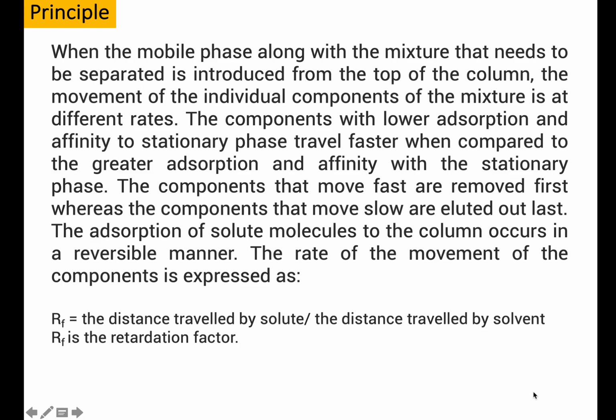How do we do that? We use silica gel or we use alumina. What are they? They are stationary phases. These stationary phases are solid. Different stationary phases can be used for different purposes in column chromatography. For today's lecture, we are doing the experiment using silica gel, which is a white powder. Remember, it's a toxic substance and bad for your respiratory system if you inhale it.